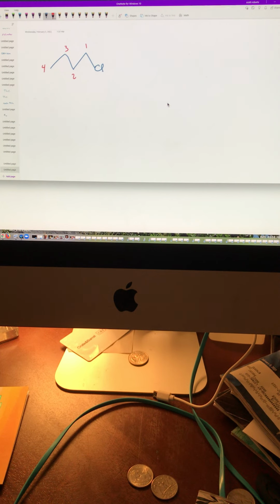Now, the next step was to put them on the field. Somewhere between 0 and 2. That might pop a little above 2 because of the chlorine, but who cares? So somewhere around 0 to 2. Who's the furthest downfield, 1, 2, or 3? 1, absolutely. It's close to electronegative elements. Then 2, then 3, then 4.